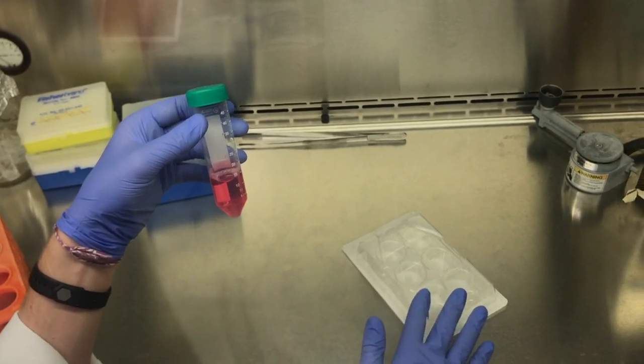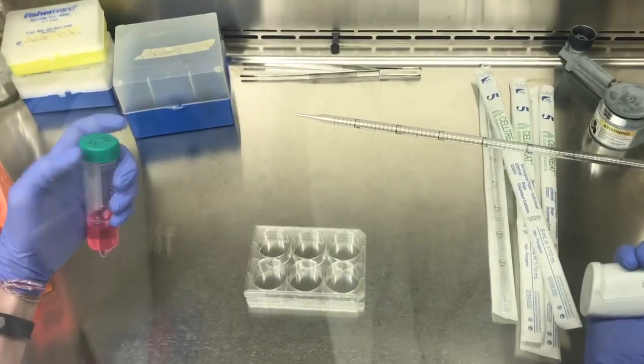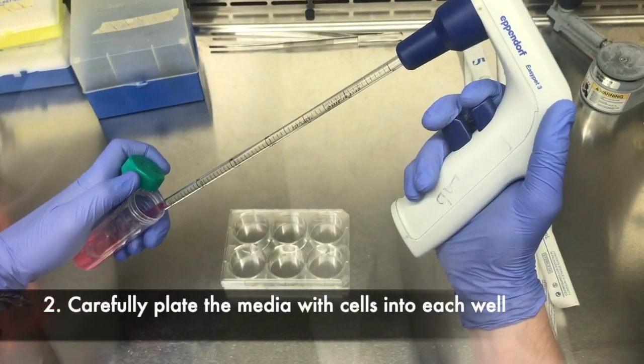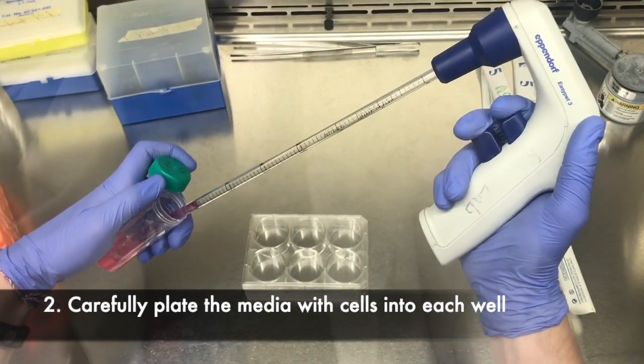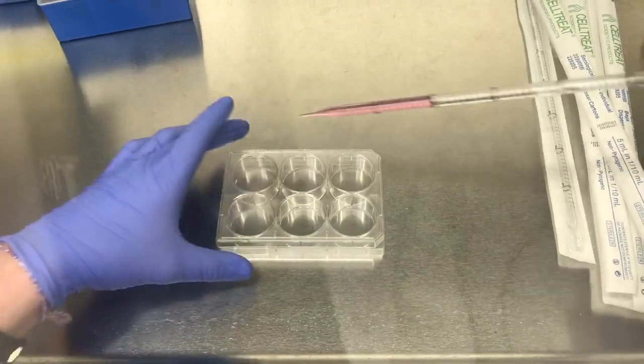Just make sure there's the same amount of cells in each well. For this assay I'll be doing two mils of media in each well. Go ahead and pipette it up and into the plate, and make sure for every well you use a new pipette tip each time to minimize contamination.